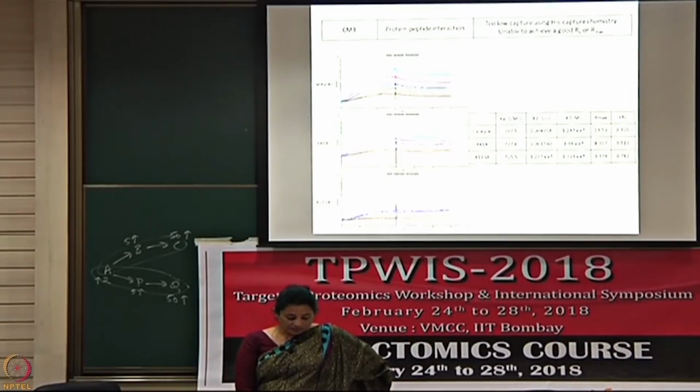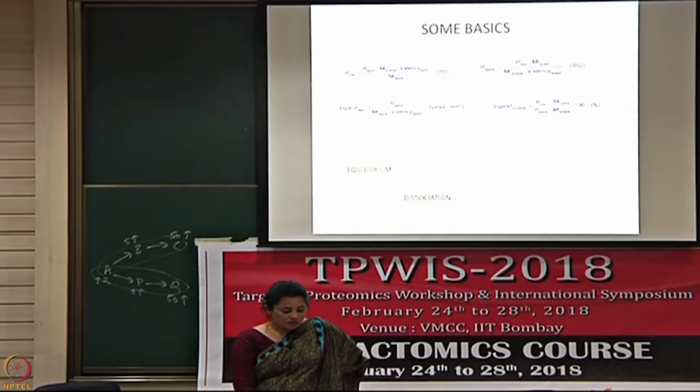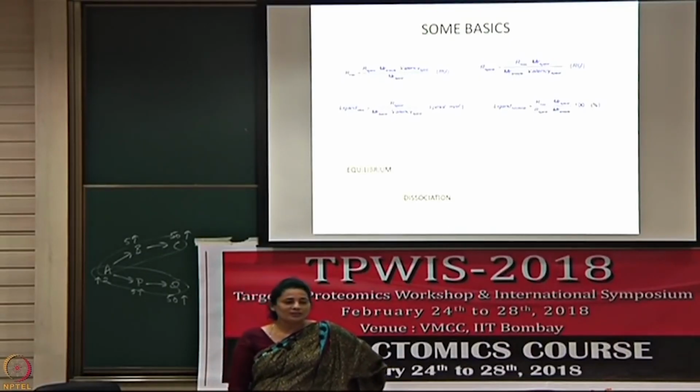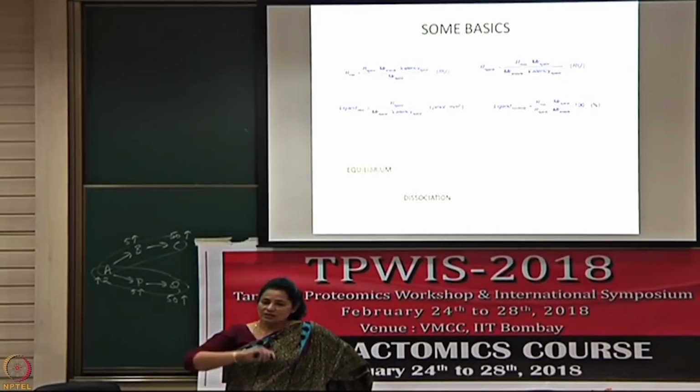And what we have come to conclude by looking at many interactions of this kind, changing the chemistry, you definitely need to change the chemistry. Either it is a thiol or it is a biotin streptavidin or direct immobilization or a capture, you need to do multiple things to confirm that these are behaving the way you should. So what we have understood now is that the IFC, the fluidic cell itself is a problem, and that needs a replacement every 6 months, costs about 6 lakhs. But we are also trying alternative chemistry as well on this and trying to reverse.